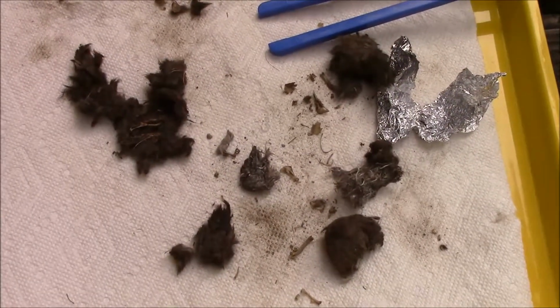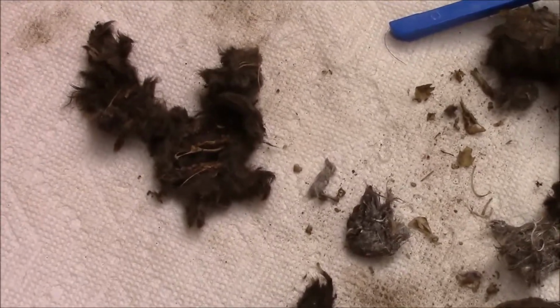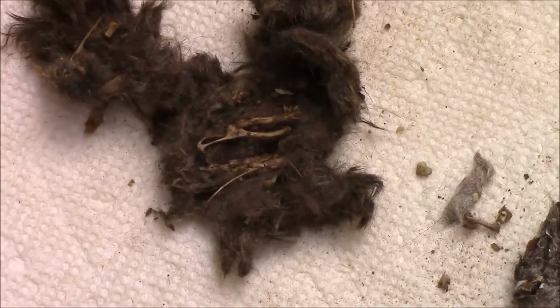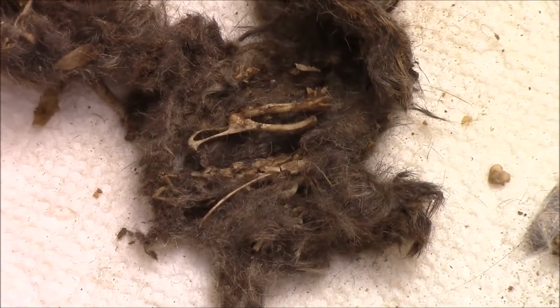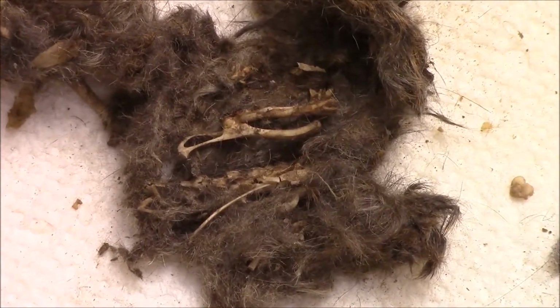Grant's been pulling apart this owl pellet, and as you can see, there's lots of tiny little bones. A lot of times you can find the whole skull in there, but this, as you can see, here's some bones right in there. This was a very furry animal that he's working with right now. So he'll be digging those out and showing you what he's found.